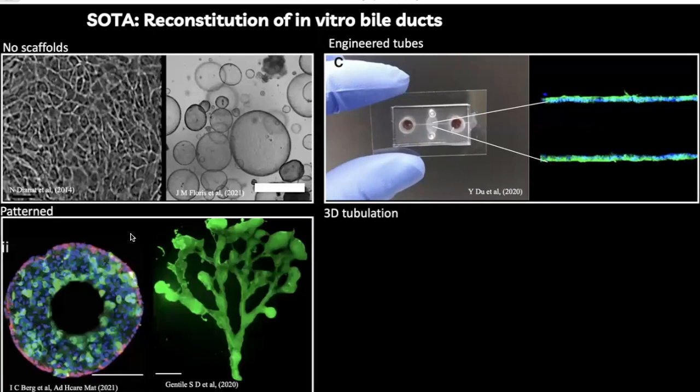Now, there's another way that you can play around with biochemical cues and biophysical cues. It's actually to pattern the extracellular matrix in 2D. So depending on how you do it, if you differentiate the hepatoblast, you can end up with variation in differentiation patterns along this planar extracellular matrix deposition. Or, as the team of Pascal Dupuy-Williams has done, they pattern this branched architecture of trees, and then they grow the primary cholangiocytes on them that eventually fold and create tubes that are branched following the ECM pattern.